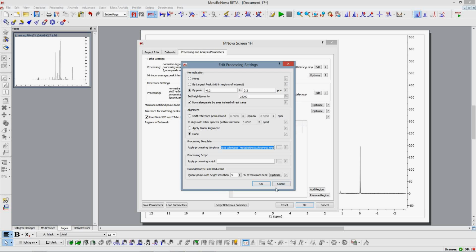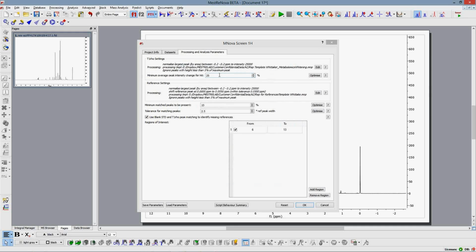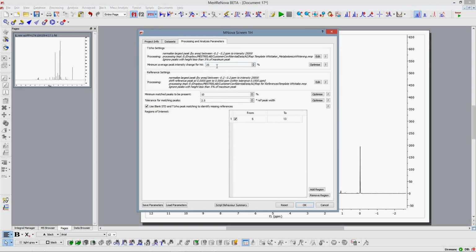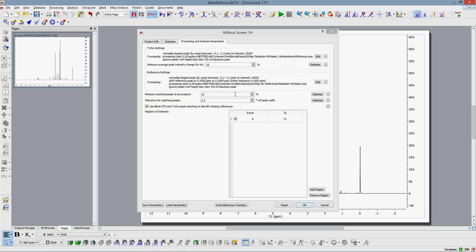Now, obviously, we are going to be needing this for everything. We are going to be needing this for our references, for each one of our particular experiments, and for each one of the experiments that I will be looking at. So in this case, we are only looking at T1 rho type experiments, but if I had in here any other experiments like STDs, like water LOGSY, this would get populated for me. In the same manner, we will have that for our references, and we will need to use that for references as well.